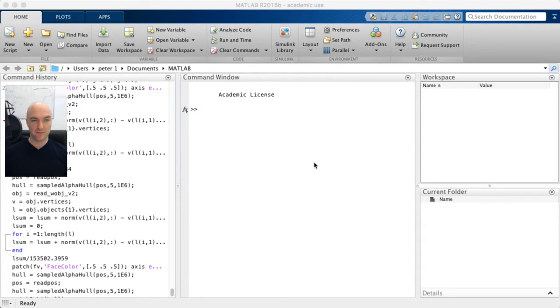With Matlab, because it's a very high-level language, you can code what you need for your analysis very quickly. You will get various components of what I would call a toolbox of Matlab programs you can use as a basis for your analysis, and I will show you how to use them.